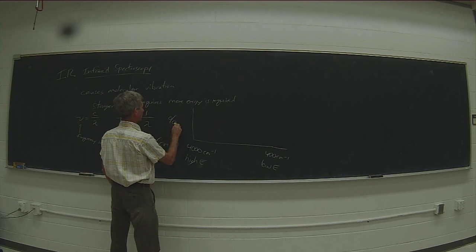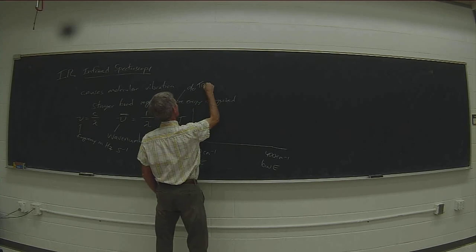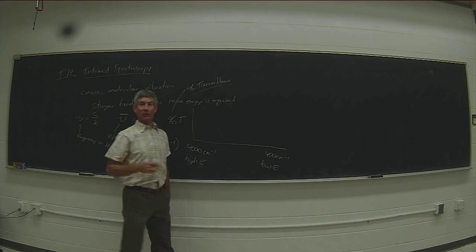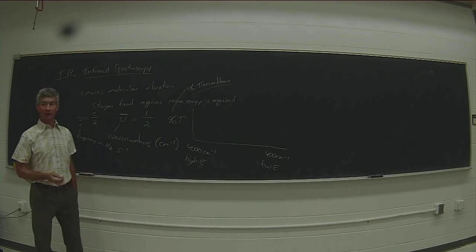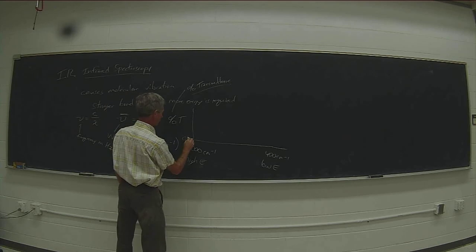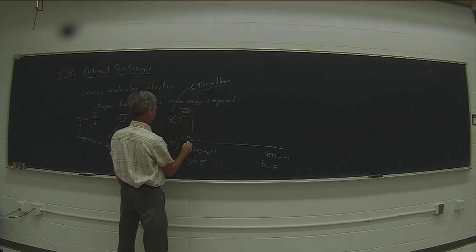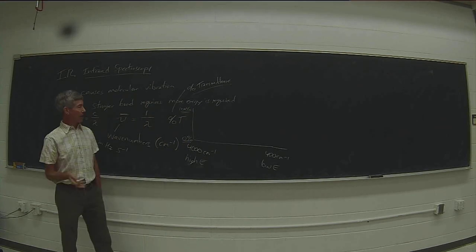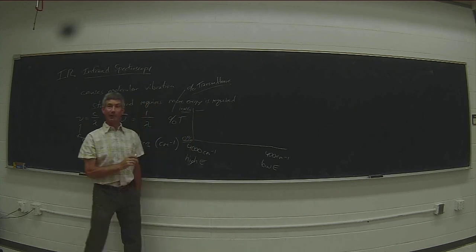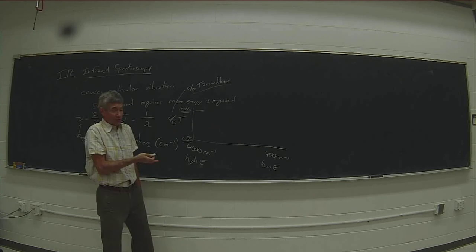And we generally look at percent transmittance, rather than the more common absorbance that you're used to looking at for UV and visible spectroscopy. So 0% transmittance on the bottom, 100% transmittance at the top. If that wavelength of light is not absorbed, we should see a baseline that's at the top. And then we'll see dips. We call them peaks, but they are in fact troughs.